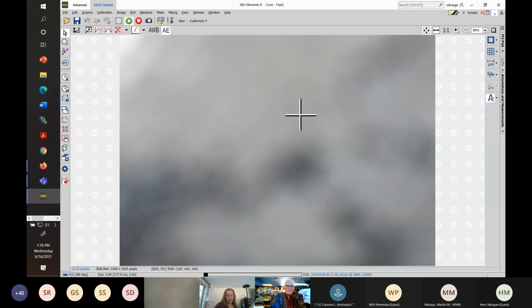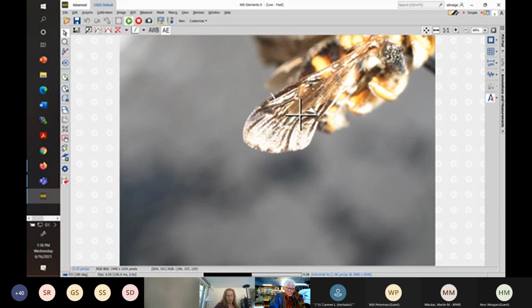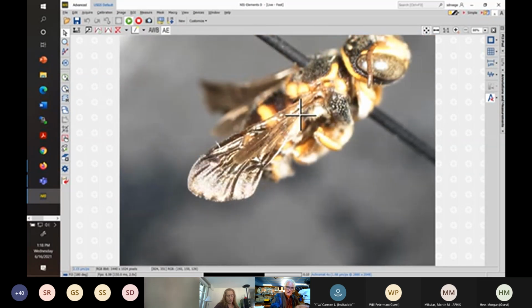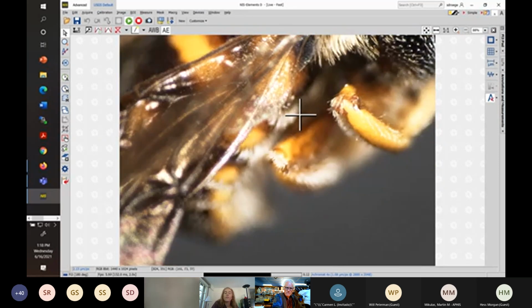This was Anthidiellum perplexum. This is Anthidiellum notatum. Actually, I lied, because perplexum does not occur in Maryland at this point. But Anthidiellum notatum does. So we're going to go now do our basal vein inspection. Zoom this up. See if I can learn to focus more quickly. Okay.